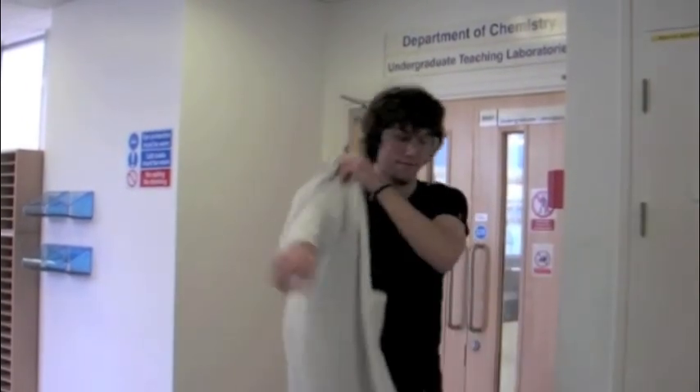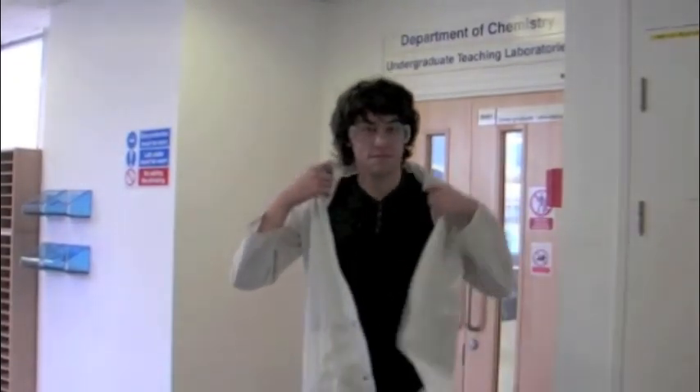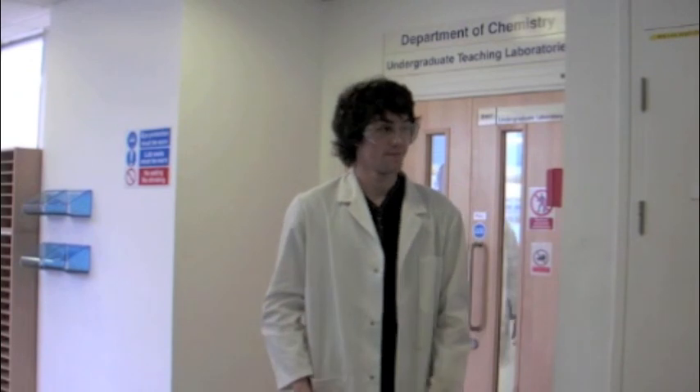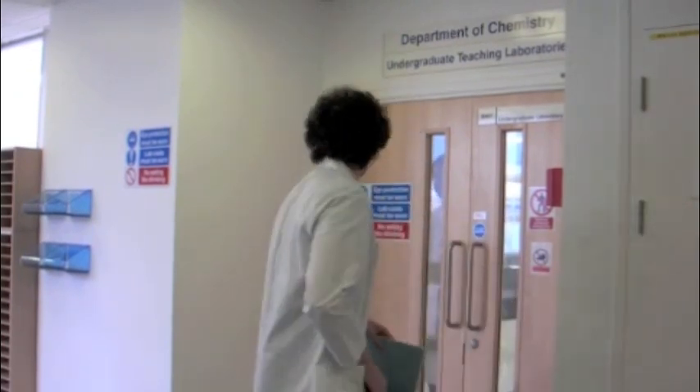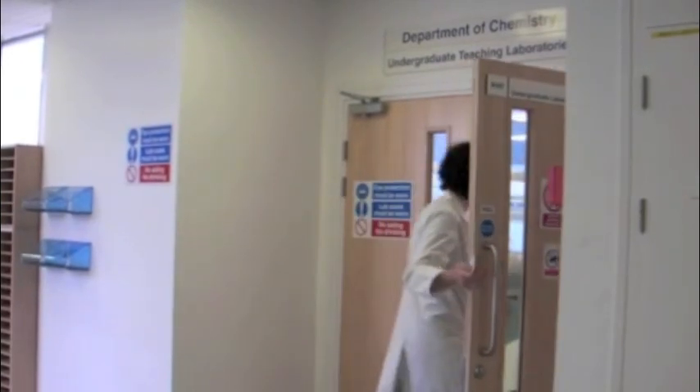To start, we are going to need a few things: safety goggles, lab coat, and finally a lab book. This contains the relative safety information for the experiment.